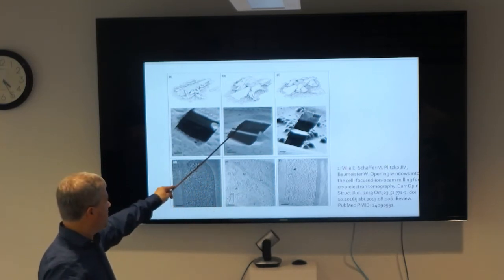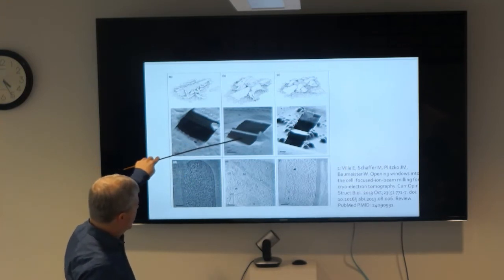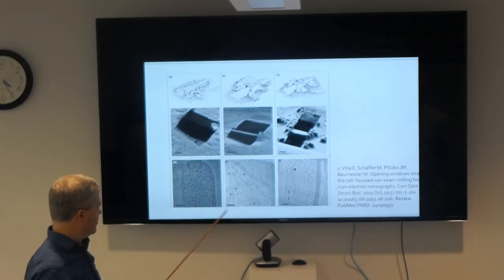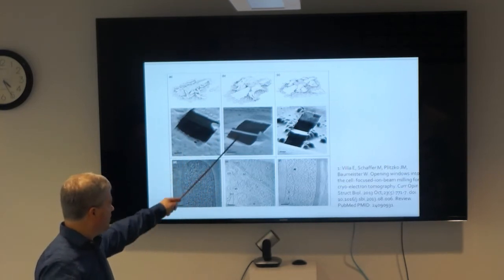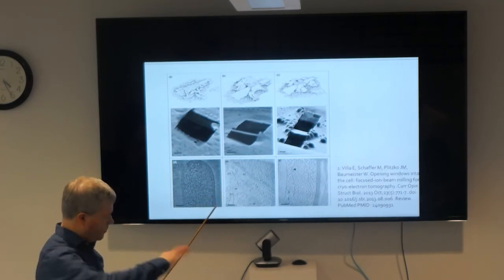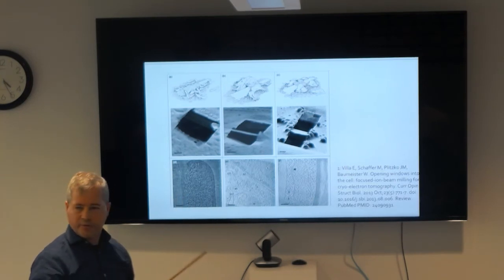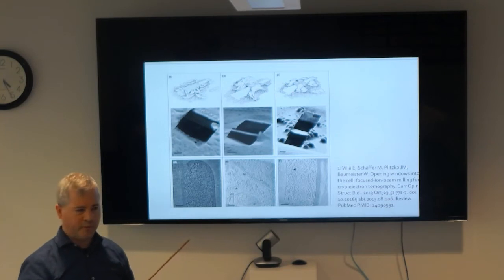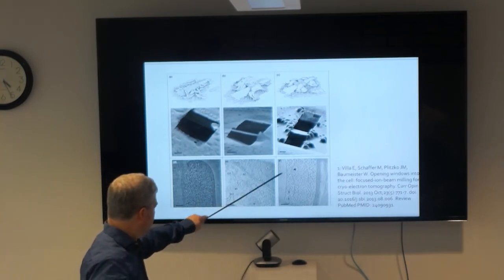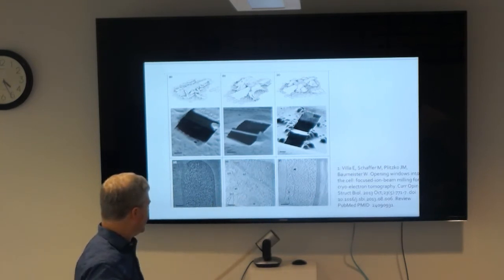So the grid, after being cut like this to leave a thin lamella, is then transferred cryogenically into a TEM, where you find the same region of interest and do tilt tomography of that, and do the reconstruction of a tilt tomogram, which I think was covered in last week's lecture by Wei Dai, right? Yeah. And then you can get very, very fine details.